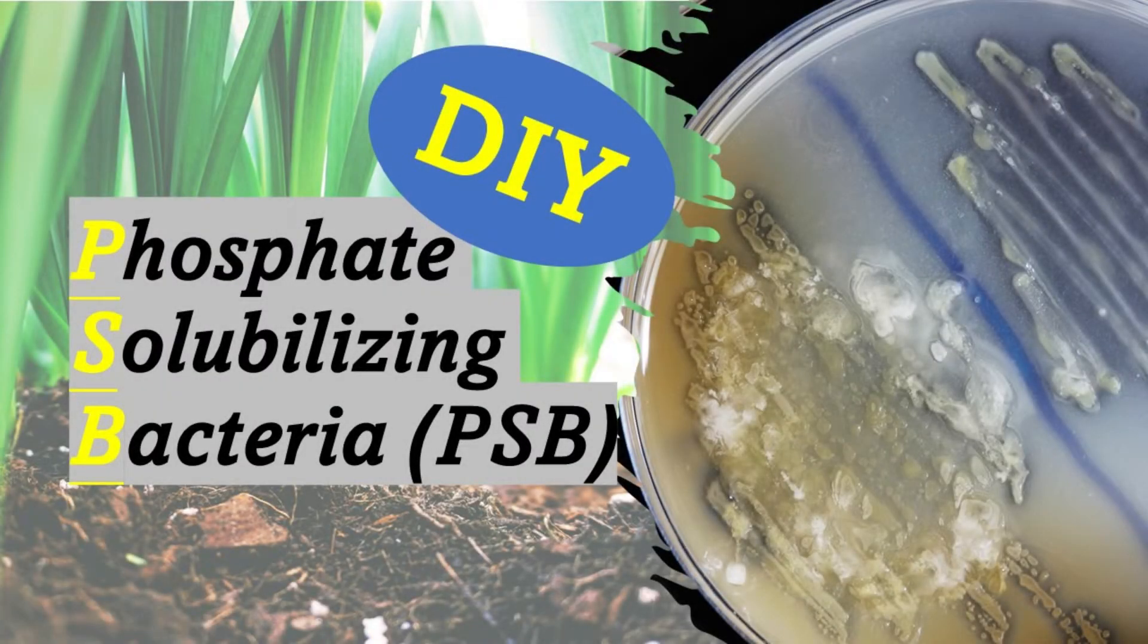Hello everyone! Welcome to today's video. In today's video, I'm going to show you step-by-step on how to isolate and culture phosphate solubilizing bacteria at home so that you can use them on your garden or other project or just simply add them to your bacteria collection.